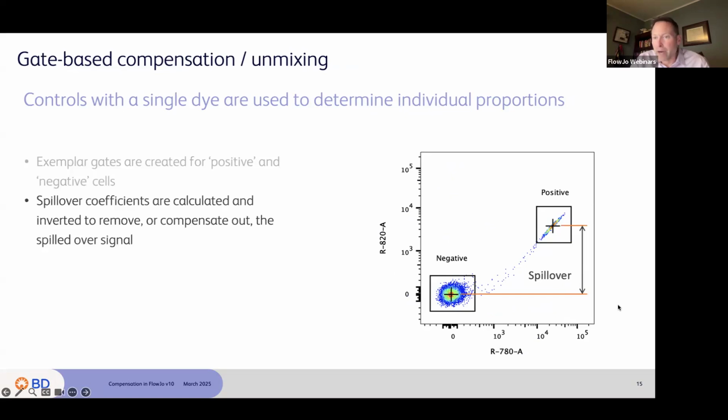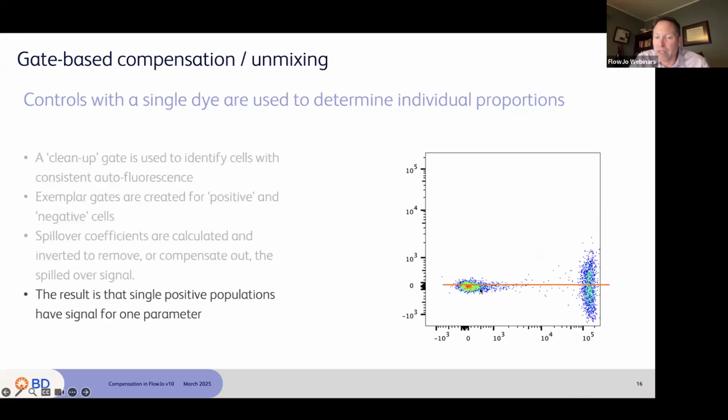And we will use our unmixing or our compensation matrix to figure out what that spillover is, subtract it so that we end up with MFIs of these two populations being equal, and then we'll know we've done a pretty good job with the compensation or the unmixing. That applies if your comp controls have followed the three rules that we pointed out earlier, and yes, they are appropriate for your actual data. But we know if the MFIs line up here, then your comp controls will at least properly compensate or unmix.